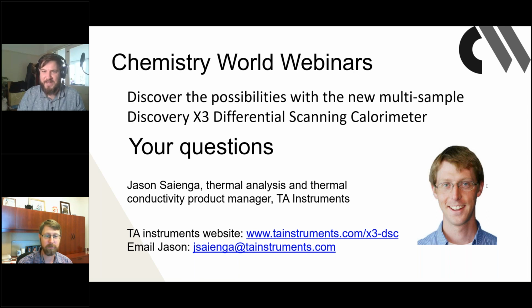And they can knock that out of their data because they know what that is from. But of course, if they have exactly the same peak, because you're running 3 experiments simultaneously, they experience the same vibration, that could be a lot harder to deal with. So does the X3 have improved vibration control, since it would be harder, or are there other things that you'd recommend to try and eliminate those sorts of real world problems?